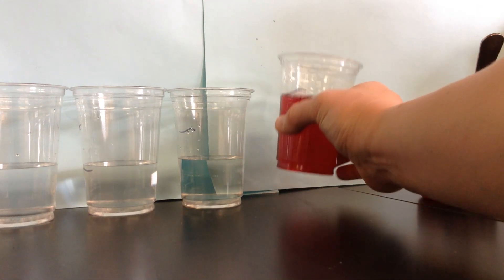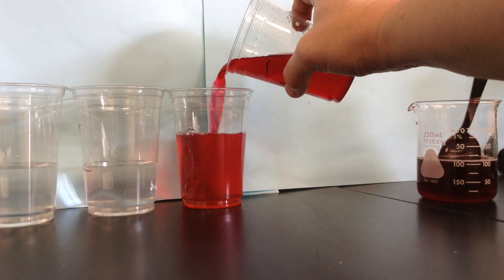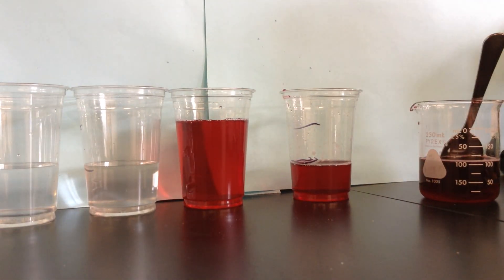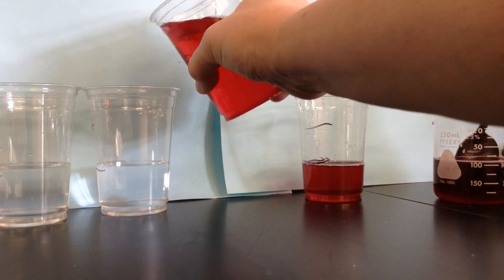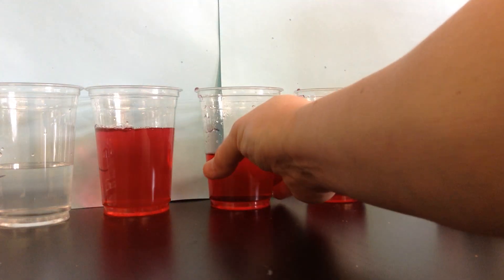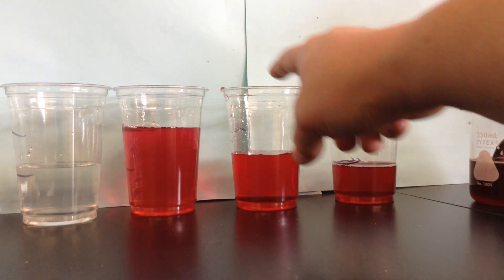And then I'm going to take my half strength solution and dilute it in half again. So now it's quarter strength, and we'll do it again. You might be noticing that the color is kind of becoming less intense as we go down the line — half strength, quarter strength, eighth.